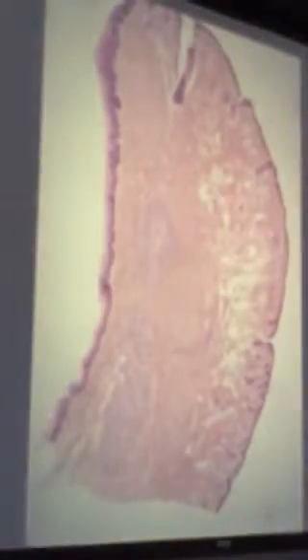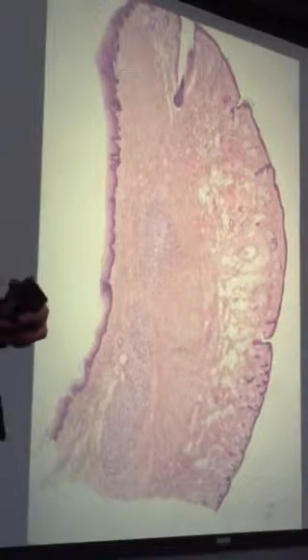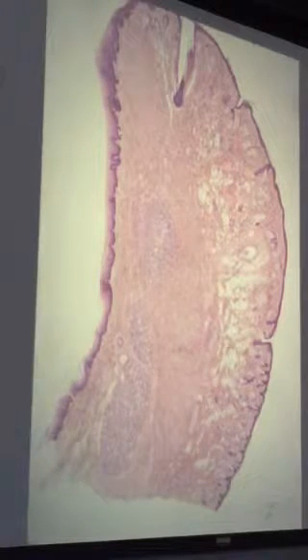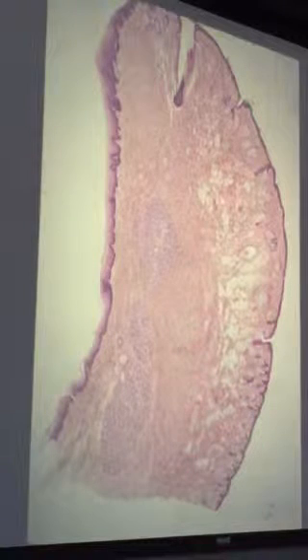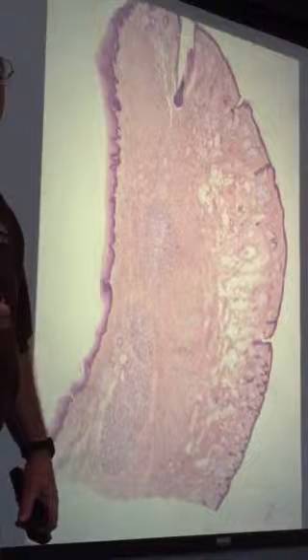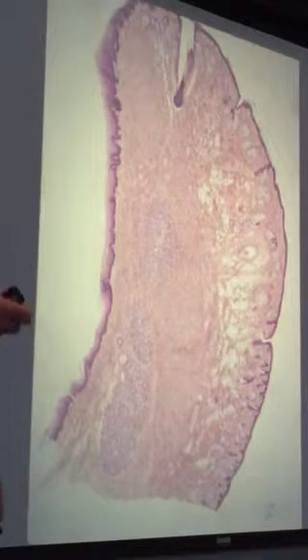Okay, and parakeratinized, let's go on to the next slide. Enough of epithelium. How about this organ? What is this? Lip. Right. How do you know? Yeah, it's got sebaceous glands, it's got hair follicles. Is this the upper lip or the lower lip? Really can't tell.